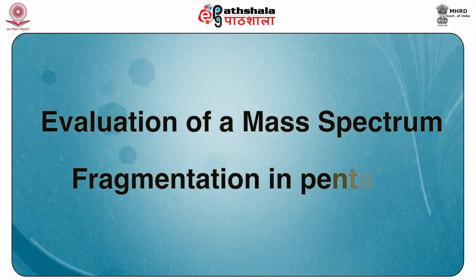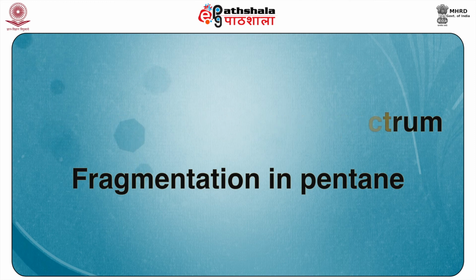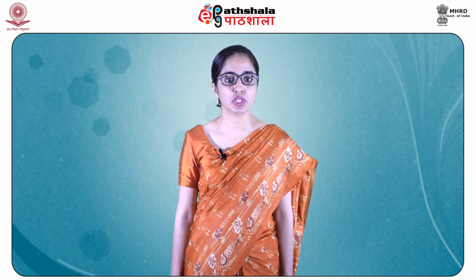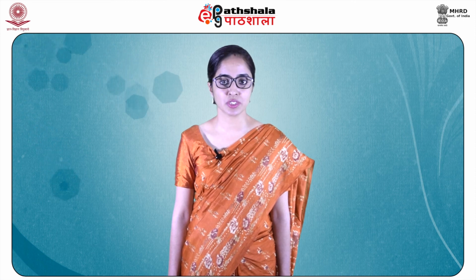Now, students, it is time to evaluate a mass spectrum after having studied in detail the instrumental techniques. We will see here in particular the fragmentation of pentane. Pentane is an acyclic hydrocarbon. The study of a mass spectrum requires prerequisite knowledge about the nominal molecular mass, the m by z value, molecular ion peak, base peak and other peaks obtained upon fragmentation.